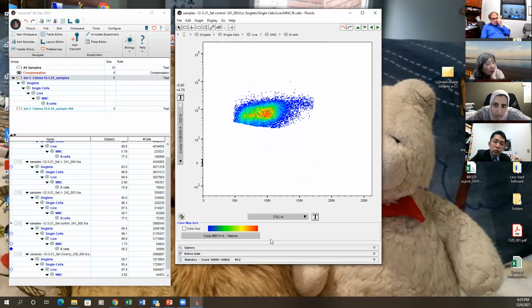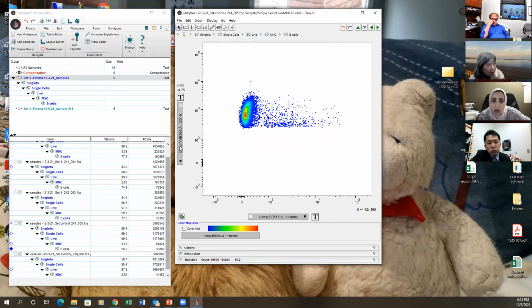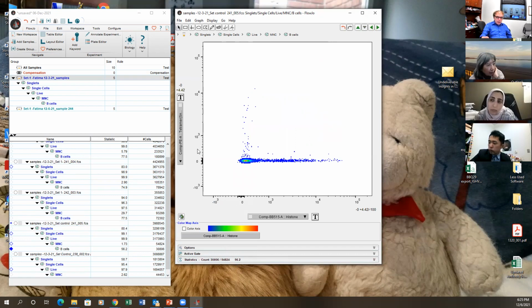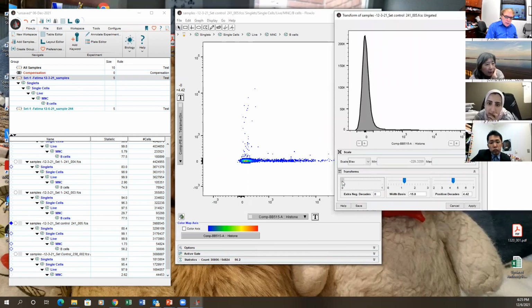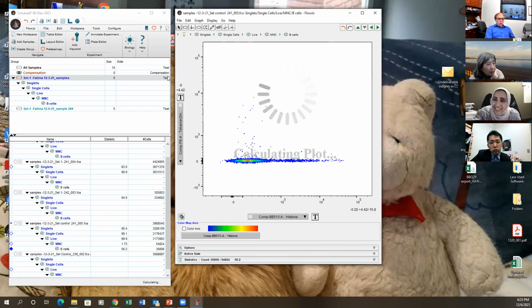So here is, before I run the CD38 for plasma cells, no, I do the antigen. Oh, this is the gold coming up here. So before you run, you look at each subset separately. Got it. This is the gold part here. The other part was silver, but this is gold.